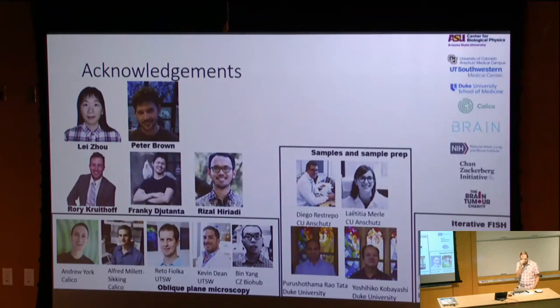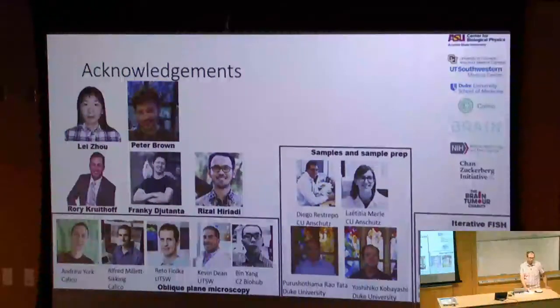This is a naive question. Wouldn't you get similar information if you were to place, say, three objectives, one from above, one from the right side, one from the front, and look at the volume, and then use the available information to construct the 3D object? Yes, you will. And it's been done. So why don't we do it?